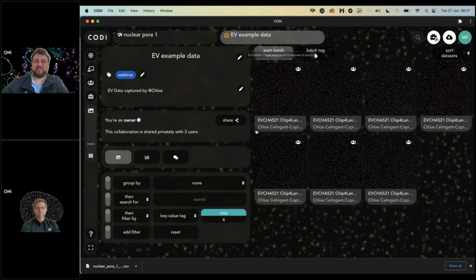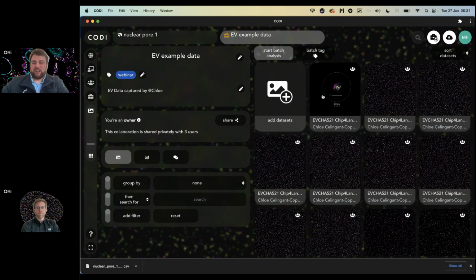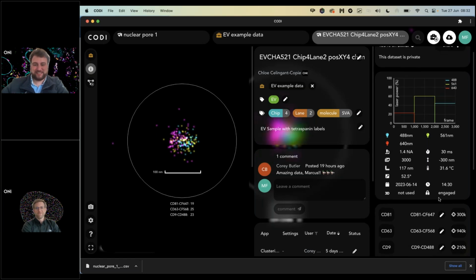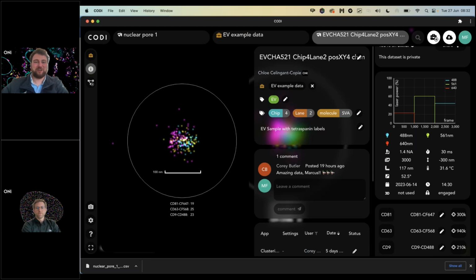And so if we click on this, it will filter just those examples for us. Okay, we can see this particular data set has already had a specific screenshot saved on it. So if I click on it, we'll see that in the data gallery here. And here we can see there's a little bit more metadata than our previous example. So well done, Chloe.